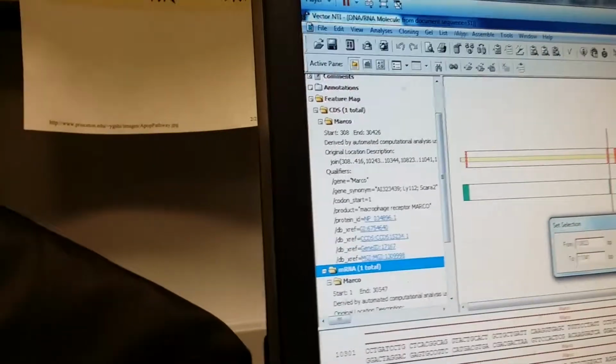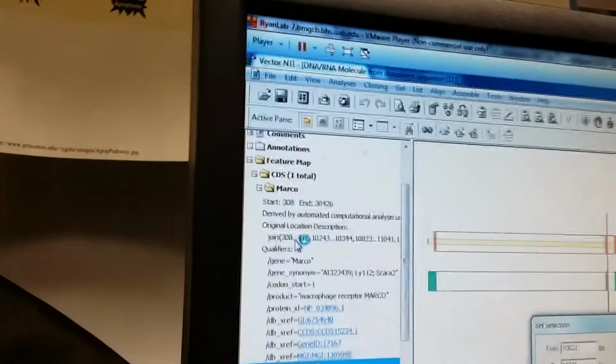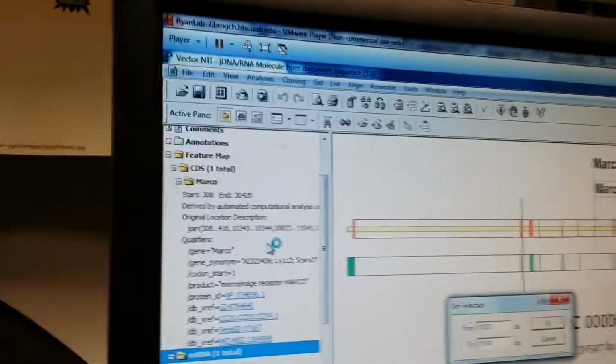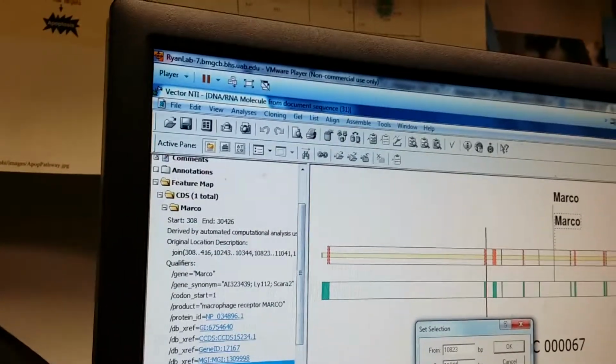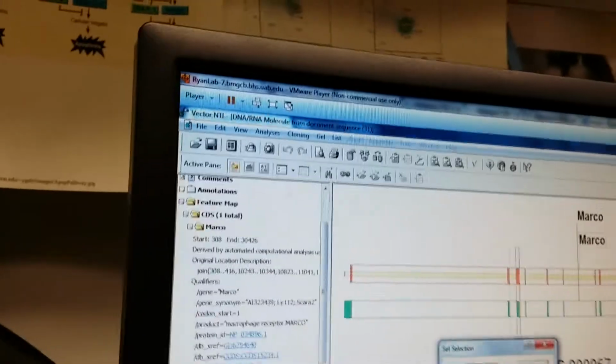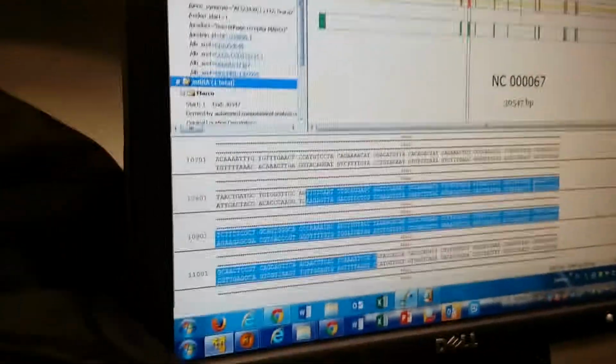What are you doing? I'm picking another exon. You see the third one, based on this is drawn. This is splice. So what is the splicing? Splice out, yeah. This is genomic DNA. So if you find an exon, this is another exon. So you can just try the GG and GG.